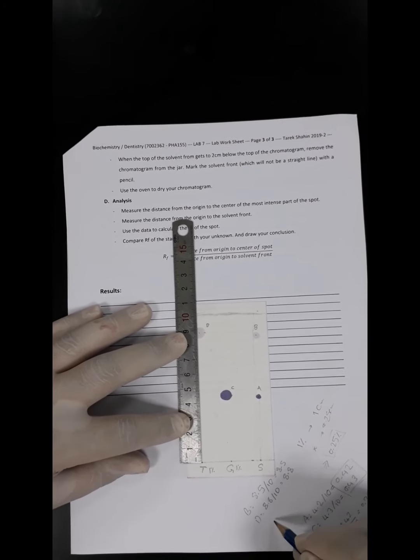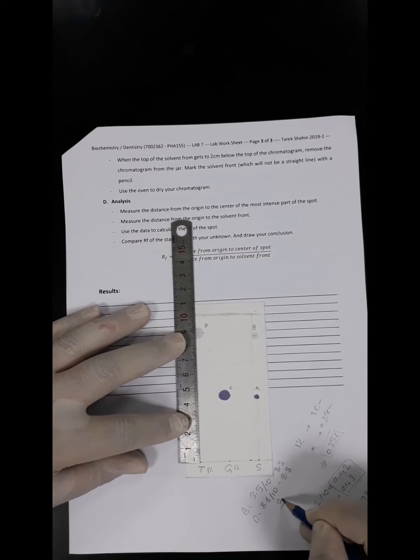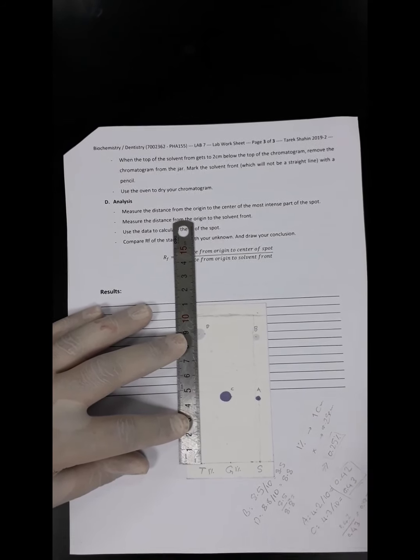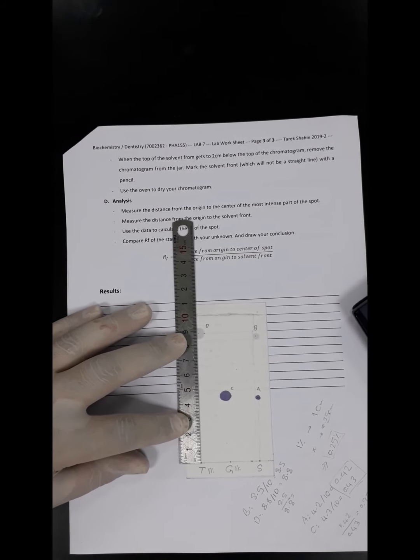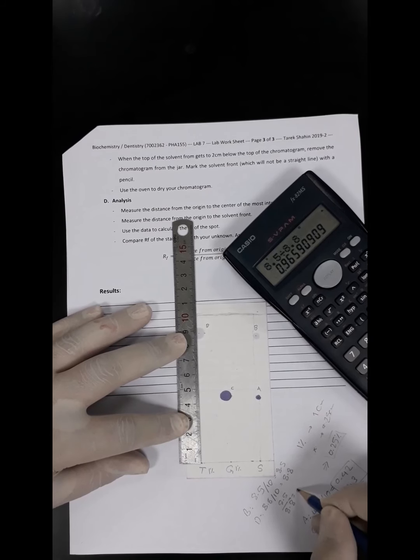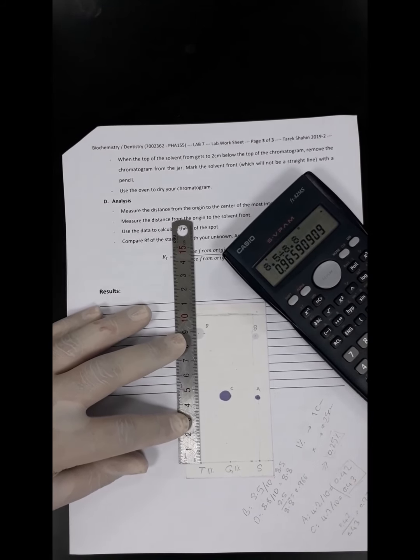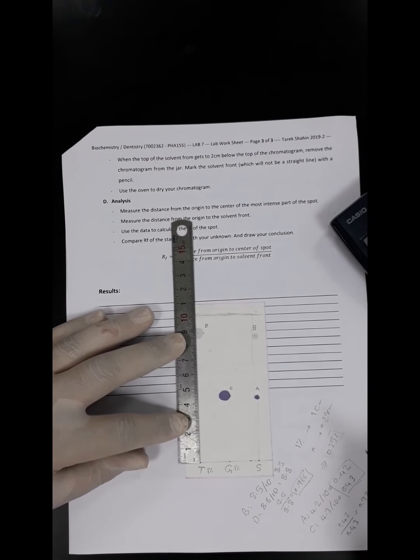Once again, we can calculate a factor, and I will let you know what that factor is. So it would be 8.5 divided by 8.8, which is 0.965. Once again, you will notice that this number is very close to 1.